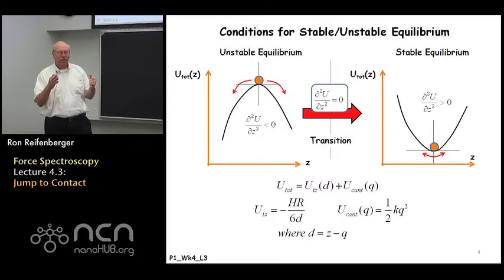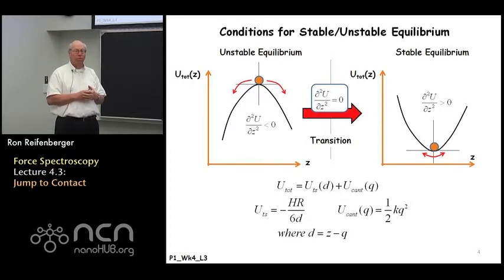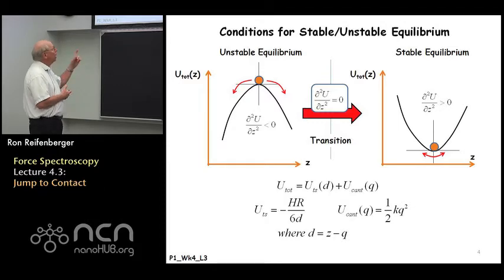So if you go back and you think about your introductory course in physics, right, you could model many different processes in terms of the total interaction potential energy. And in particular, the second derivative of that total interaction potential energy gives you a criterion for deciding whether a particular condition is in stable or unstable equilibrium. So I list the two extremes here.